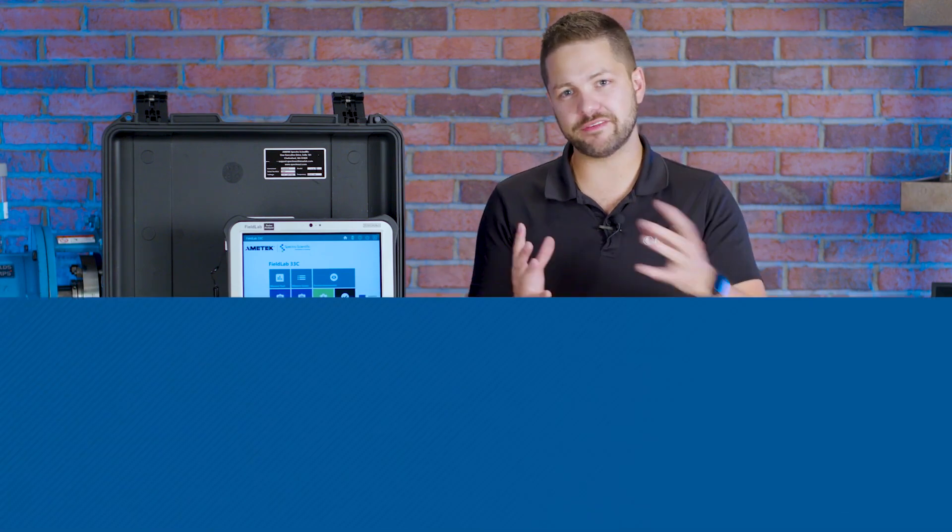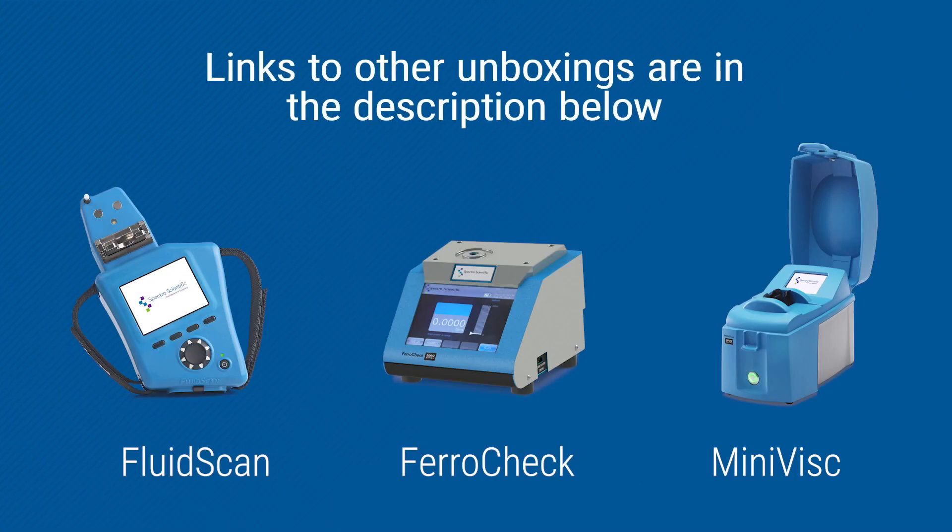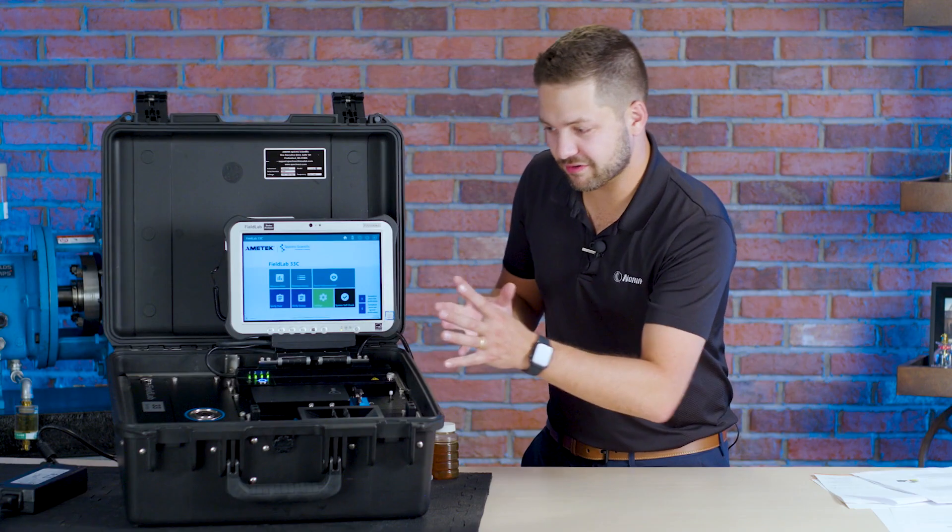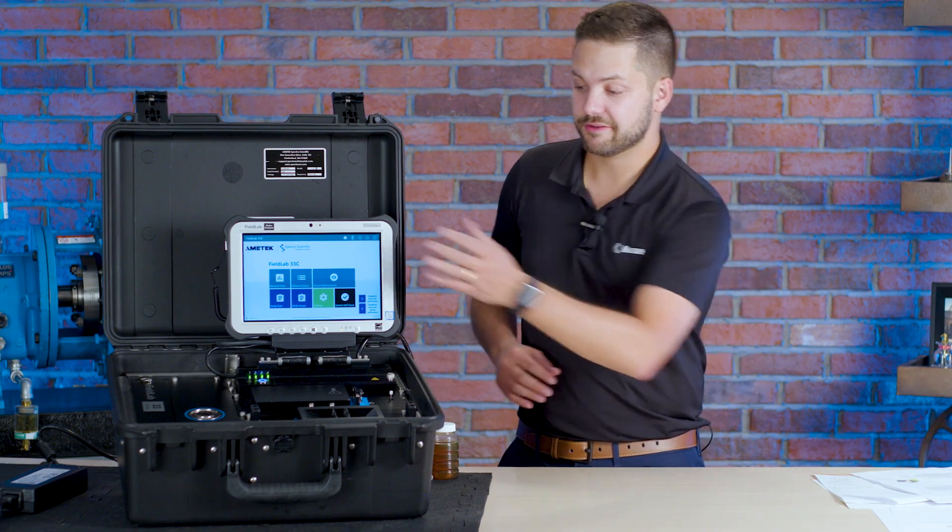Now all three of these you might have seen in some other unboxings because they are standalone products and they all can come in the Minilab system. But the fact that they're all compact in here is great.